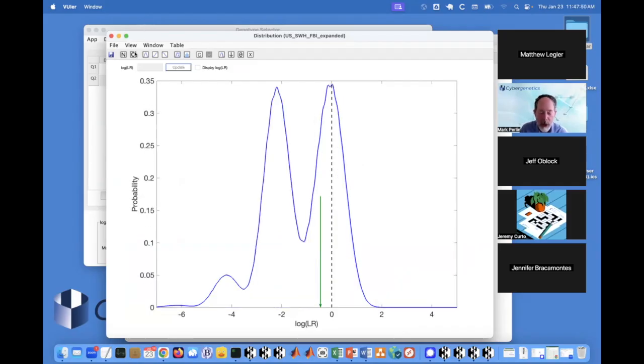So there's the non-contributor distribution, and you see that that max statistic looks like it's around -1 in TrueAllele. We brought it into TrueAllele for this analysis. Oh no, sorry, -0.5. The scale changed. So it's 0, -1, -2. So the match statistic is around -0.5. And so that looks like it's okay. That looks like it's in the non-contributor distribution.